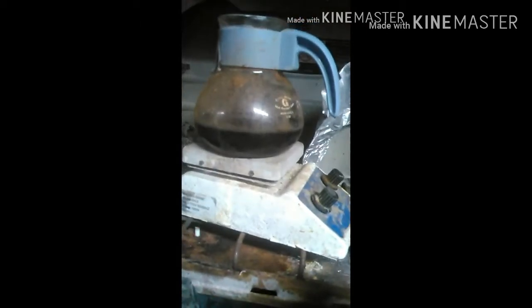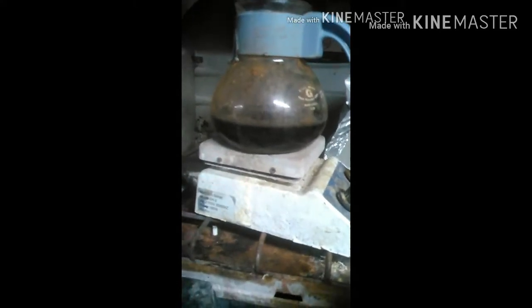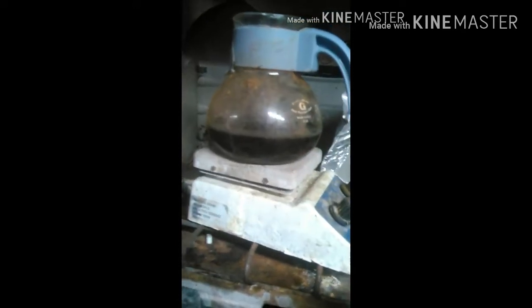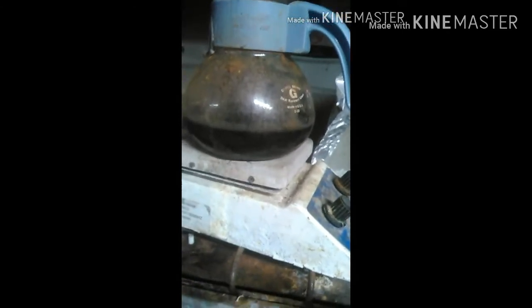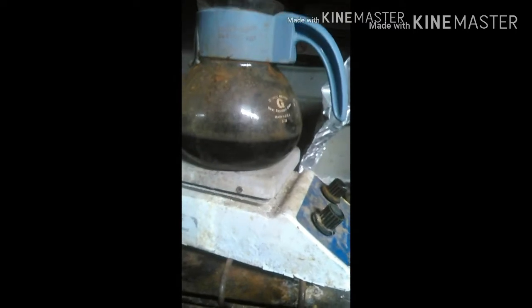Hey guys, welcome back. So I'm a little down the process already, so to catch you up: what I've got here is hydrochloric acid, 31.45%, and then just your regular store-bought hydrogen peroxide. That's what the liquid is, and inside of there is my platinum and palladium from catalytic converters.